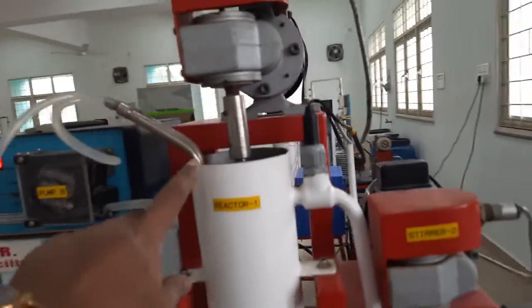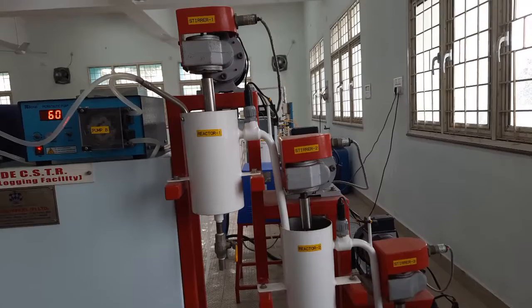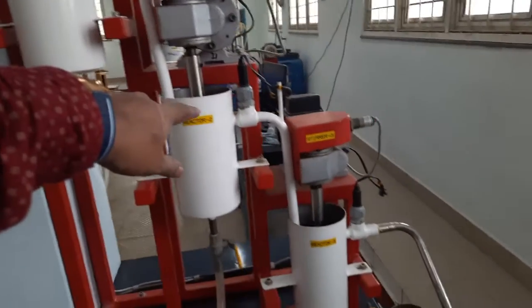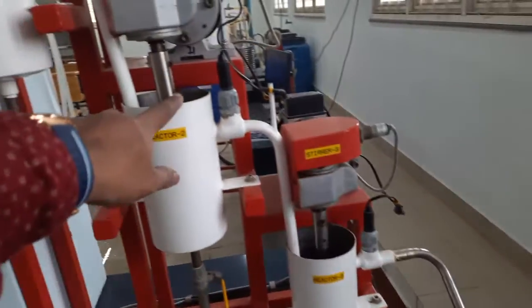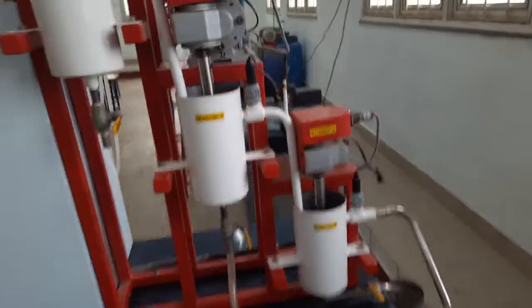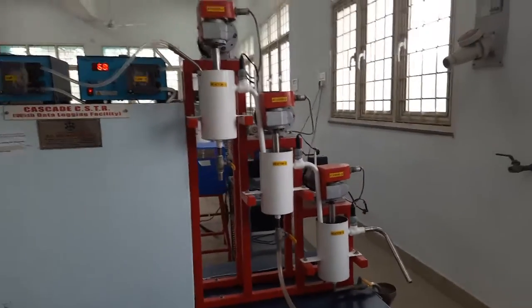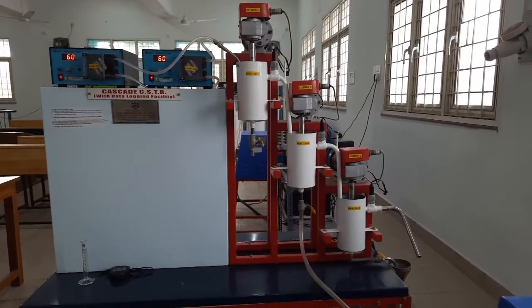So the difference between the earlier experiment and this experiment is, here we are letting the product mixture from reactor 1 enter as a feed to reactor 2. Again, well mixing is taking place. In the CSTR reactor, complete back mixing is there, and we have the product stream from reactor 2 which is sent as the feed to reactor 3, where again we maintain continuous stirring and complete back mixing. Ideal CSTRs in series, 3 CSTRs, is called a cascade reactor.